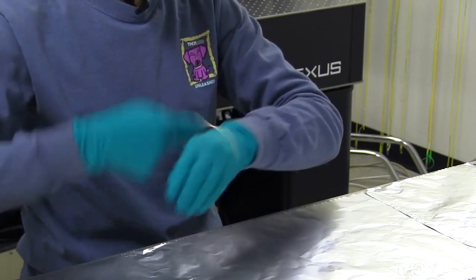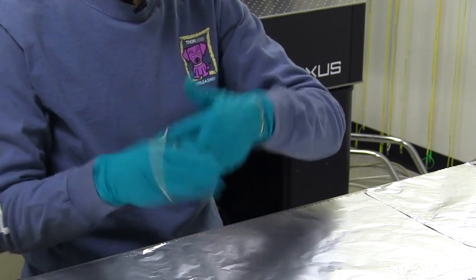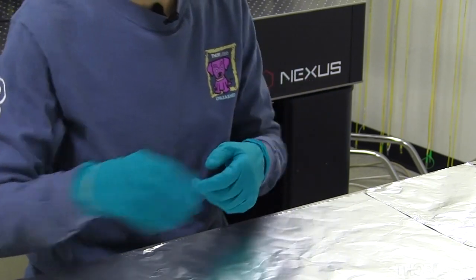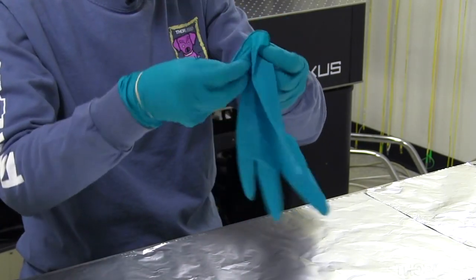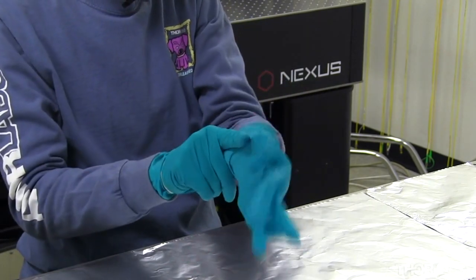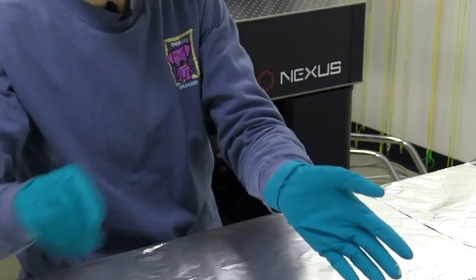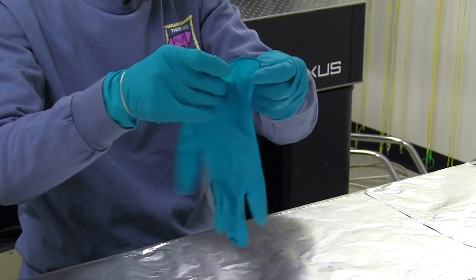I'll use a rubber band at my wrist to hold the first layer of gloves on — they'll keep these gloves in place when I take off my second layer. When I put my second layer of gloves on, I like to fold up the cuff because that will make it easier to take them off in the future.